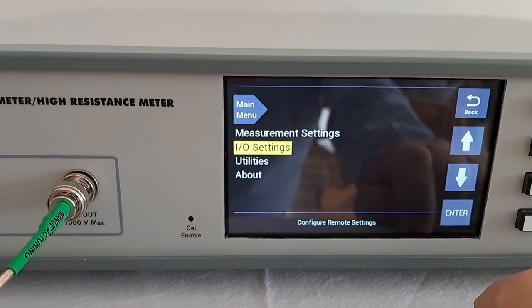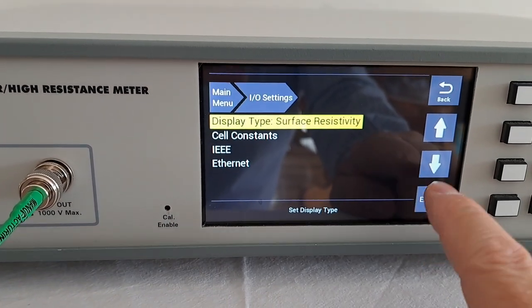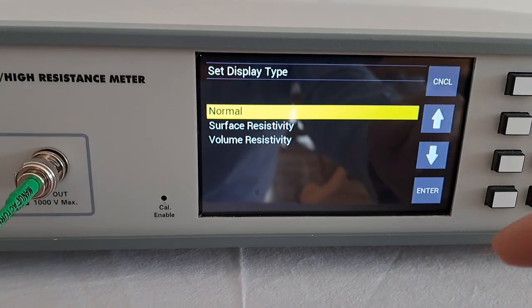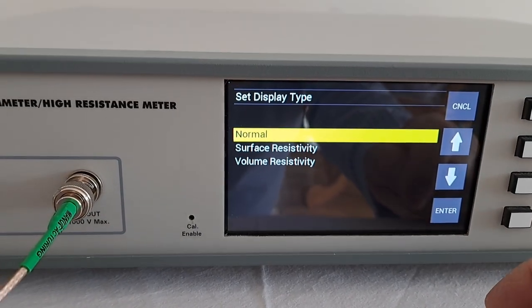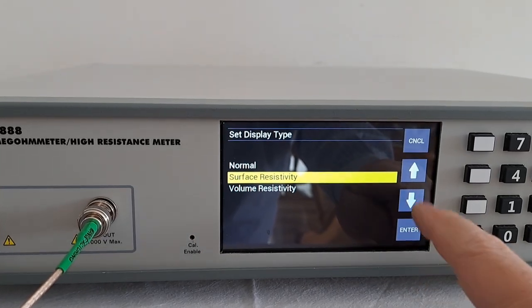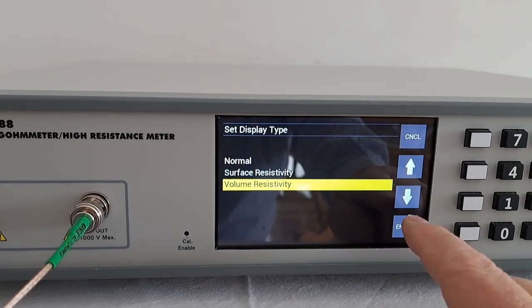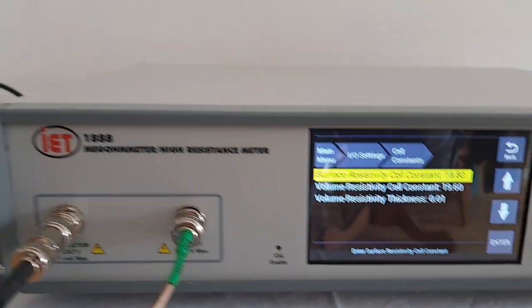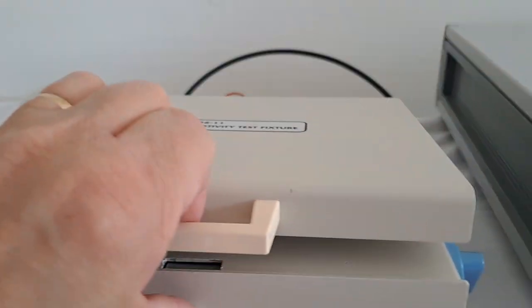In the I/O settings, press enter and then enter on display type. You can select either normal — which is standard resistance — or surface resistivity, or volume resistivity. In this case we'll select volume resistivity. You can also select cell constants.